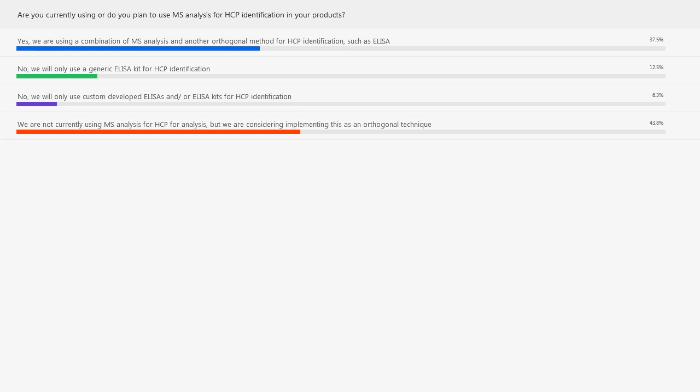And the overwhelming majority, 43.8%, voted for we are not currently using MS analysis for HCP analysis, but we are considering implementing this as an orthogonal technique. So what do you think about those results? Are they surprising, Christina and Gillian?